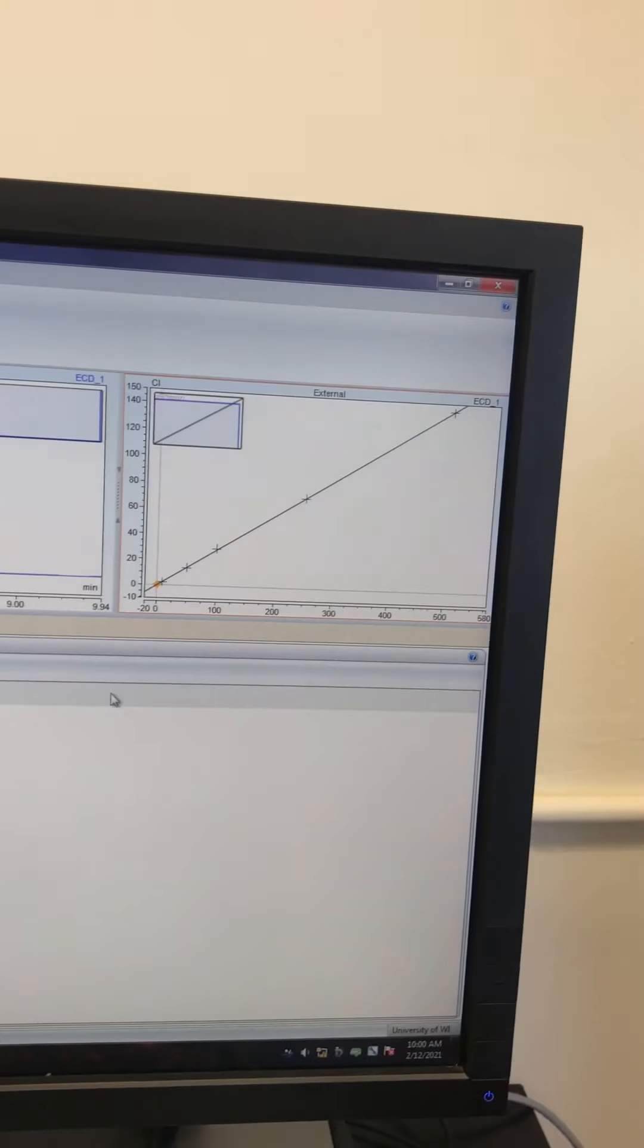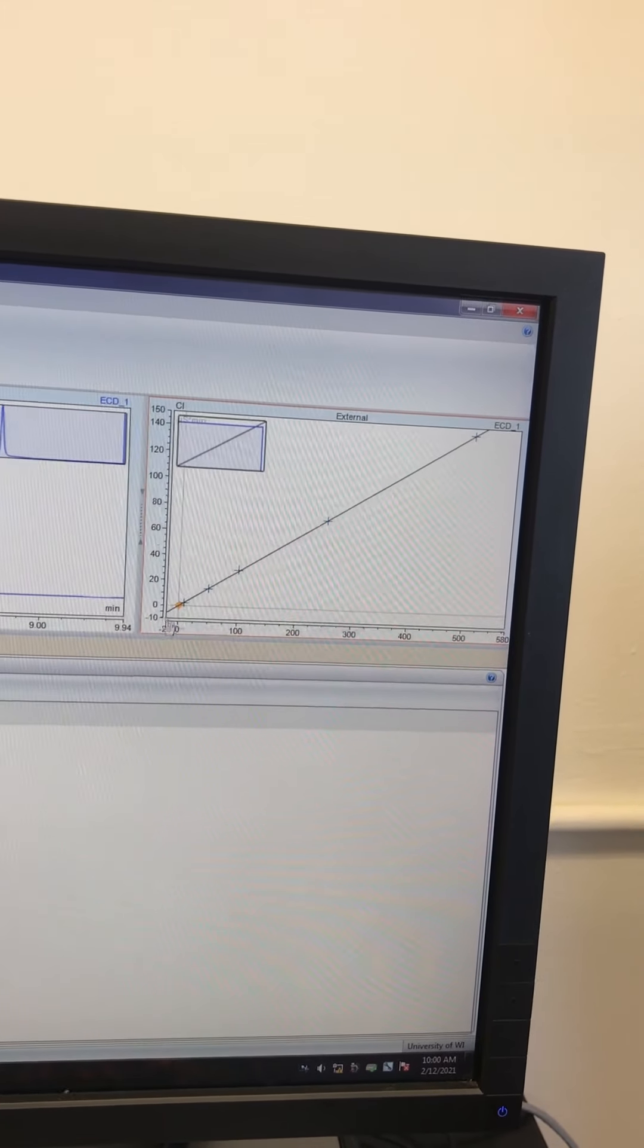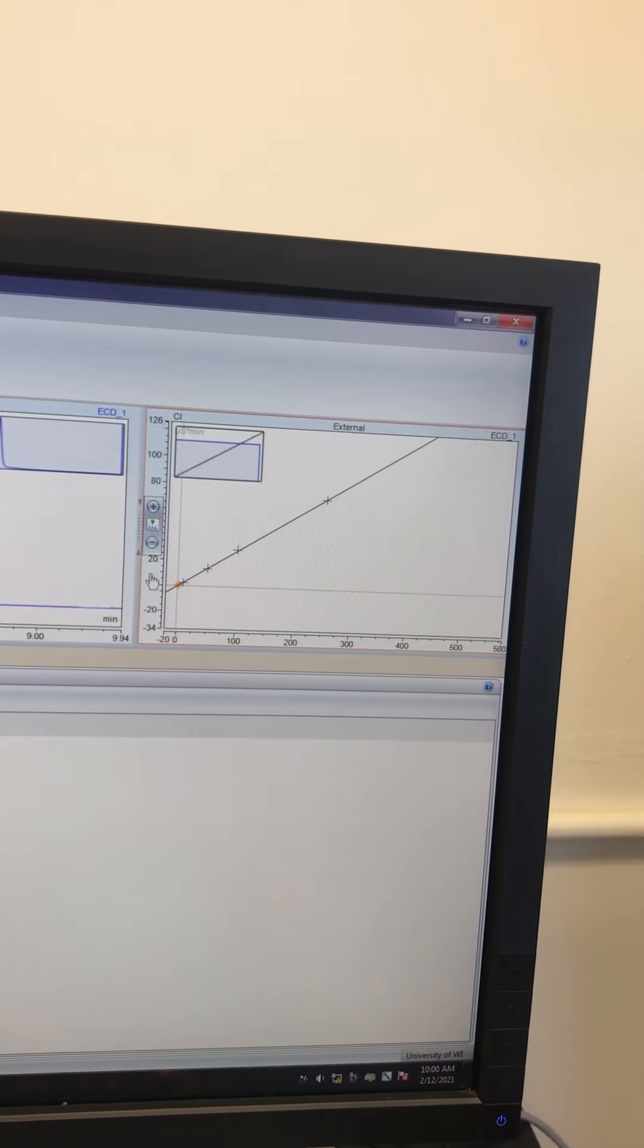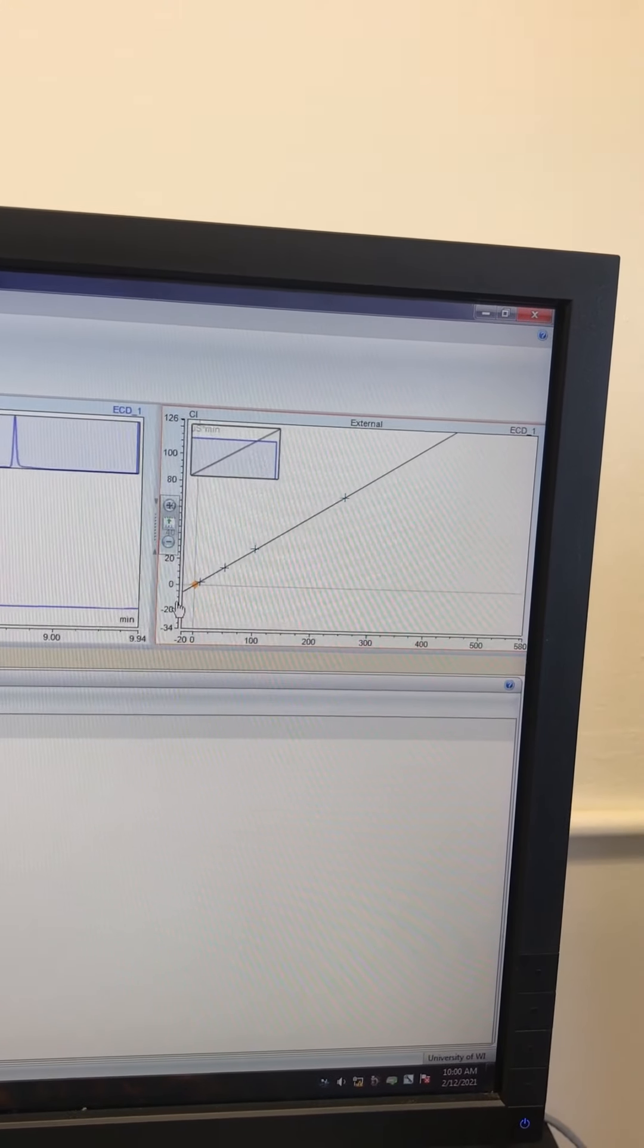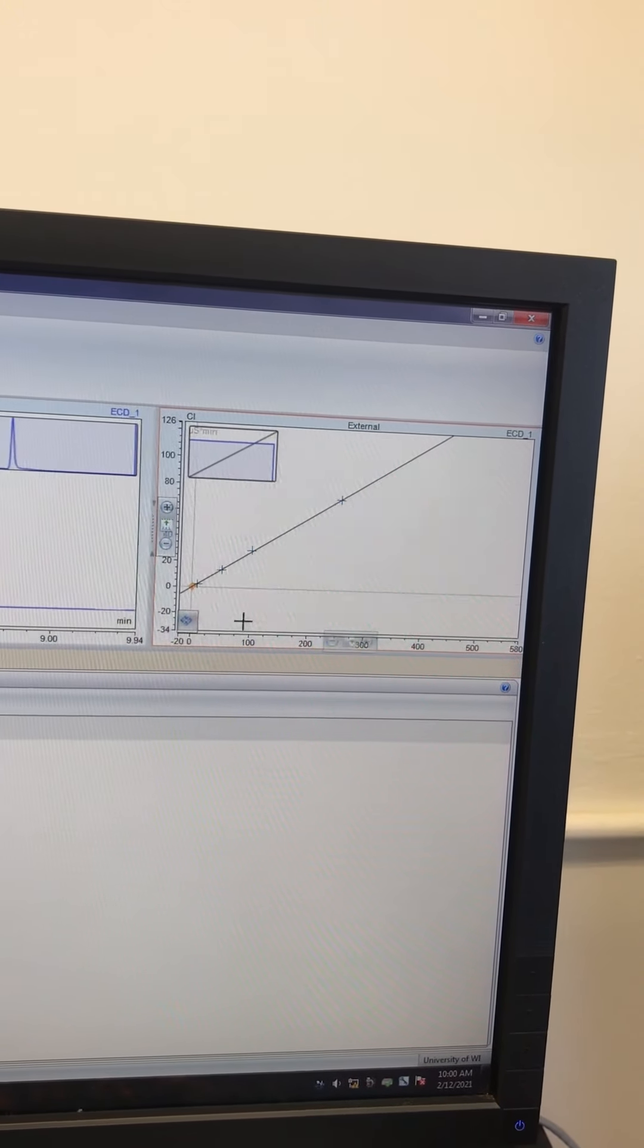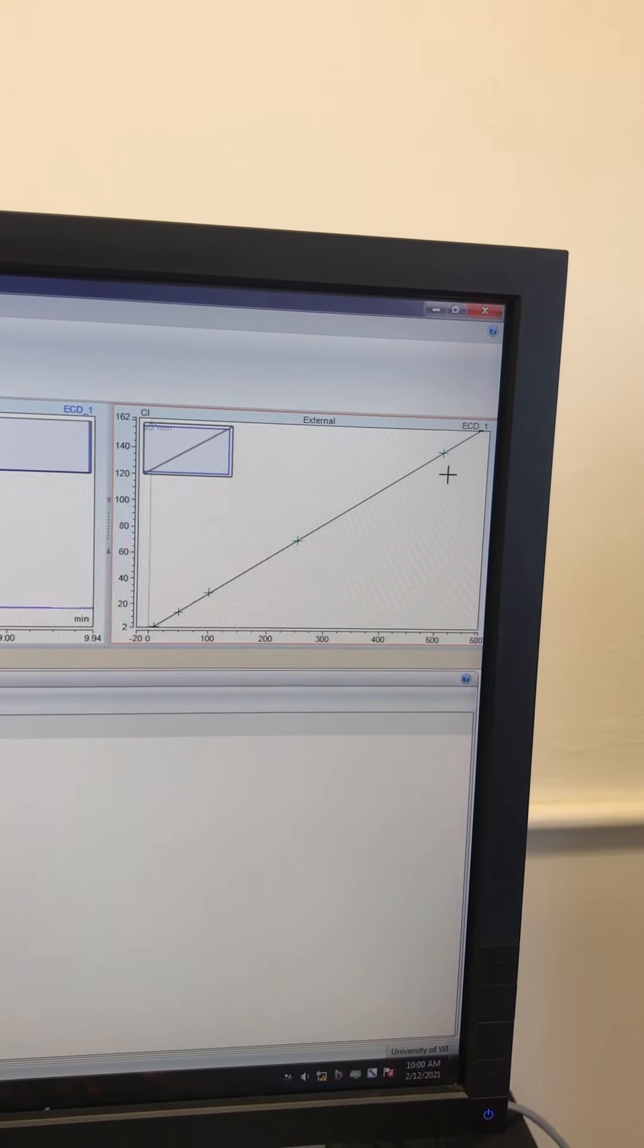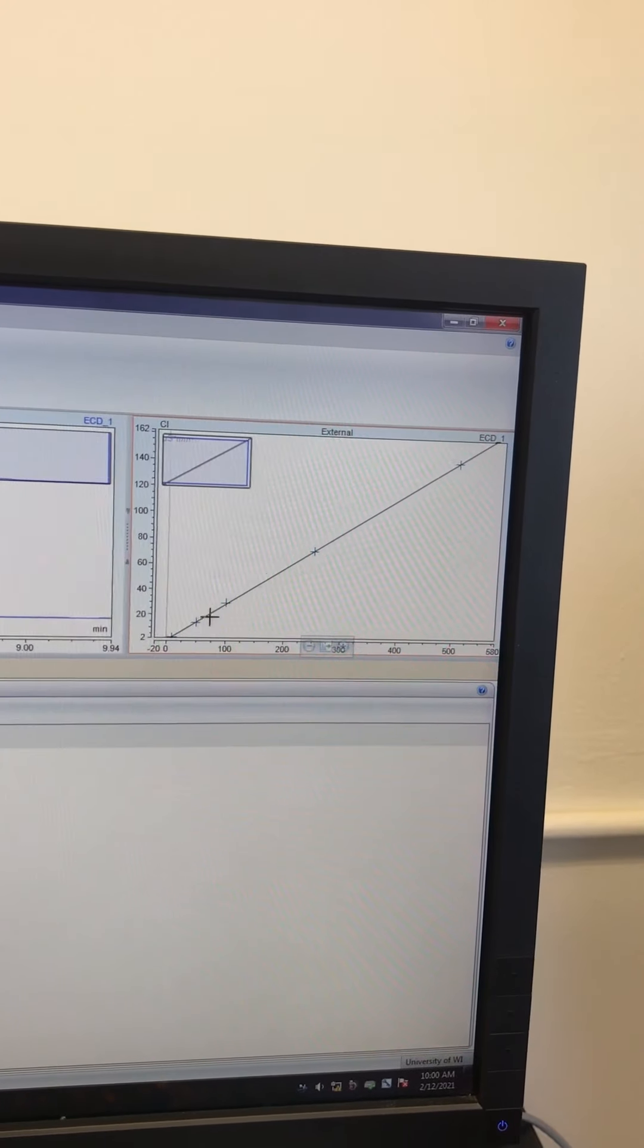That creates this calibration line here. Now the machine knows, or I am sure, that the machine can accurately measure chloride between 1 milligram per liter, our lowest calibration standard, and 500 milligrams per liter, our highest calibration standard.